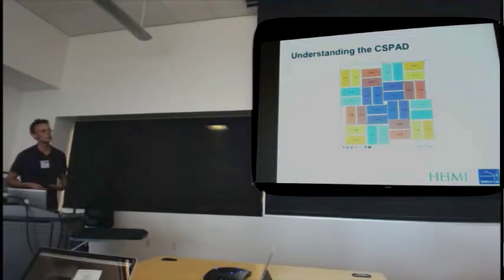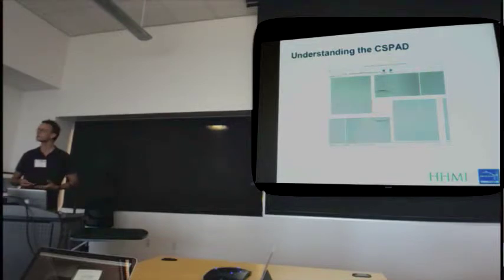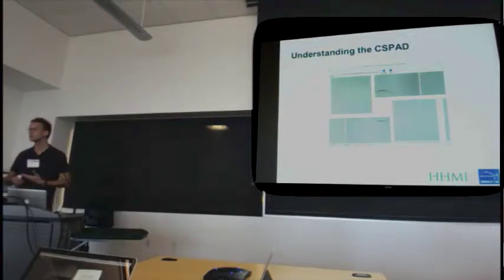We, of course, wanted to verify this for ourselves, to replace all these colors with actual data. And when we did that, we chose not to look at just one single image, because that first sample data set we had wasn't particularly strong. So we introduced this idea of looking at composite images, where we summed up a whole lot of different images. What we would have expected to see in that case were concentric rings.